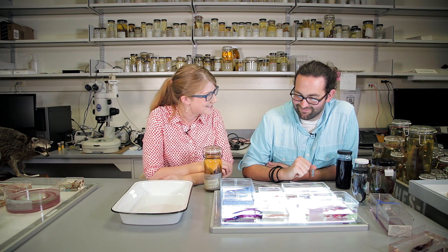We're here with Dr. Caleb Macmahan, who's the collection manager of fishes at the Field Museum, and today we're going to be talking about clearing and staining. What is clearing and staining?